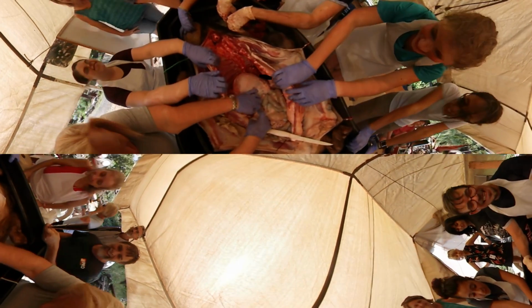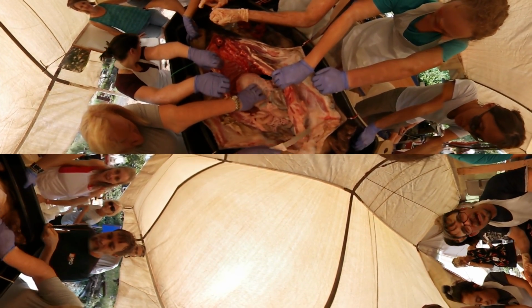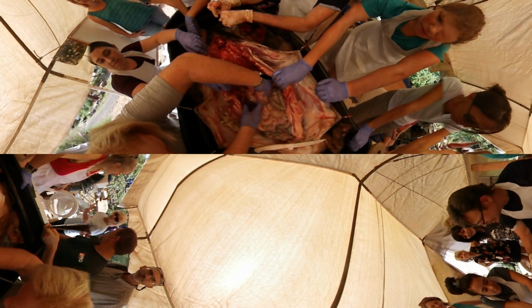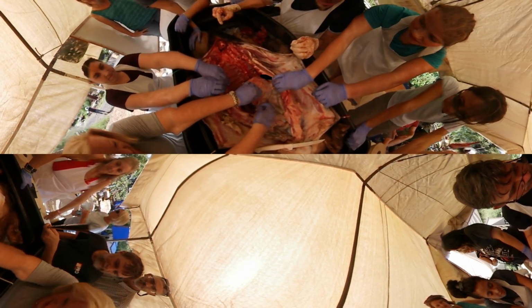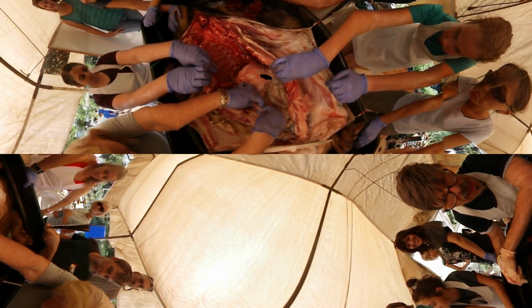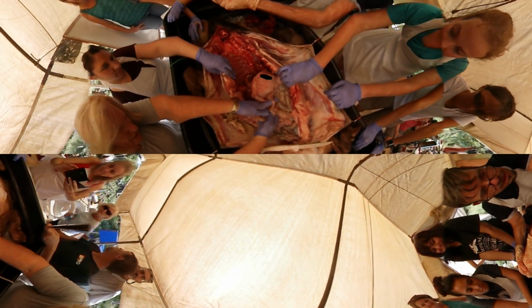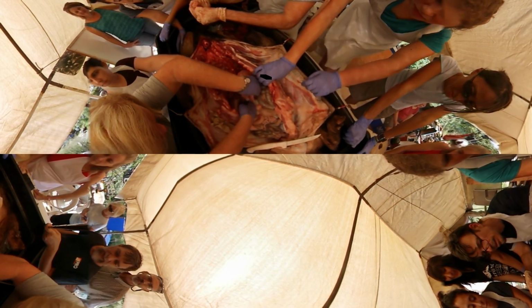So back to our anatomy. We're down to our stomach, and then the duodenum. Now the duodenum goes in a C shape, right? And it actually travels around the pancreas. So where Janet is dissecting right now is down around the duodenum, and that's where the pancreas will be. This is the stomach, a big stomach. We're coming out of the end of the stomach here, and this is where the intestines are going to start. There's another sphincter right here somewhere. So this is the beginning of the duodenum. Okay, you see that? And then it starts on a little trail. Chemically, if Mr. Piggy eats fat, we're going to have a call for the gallbladder, and that's what I was looking for underneath the liver.